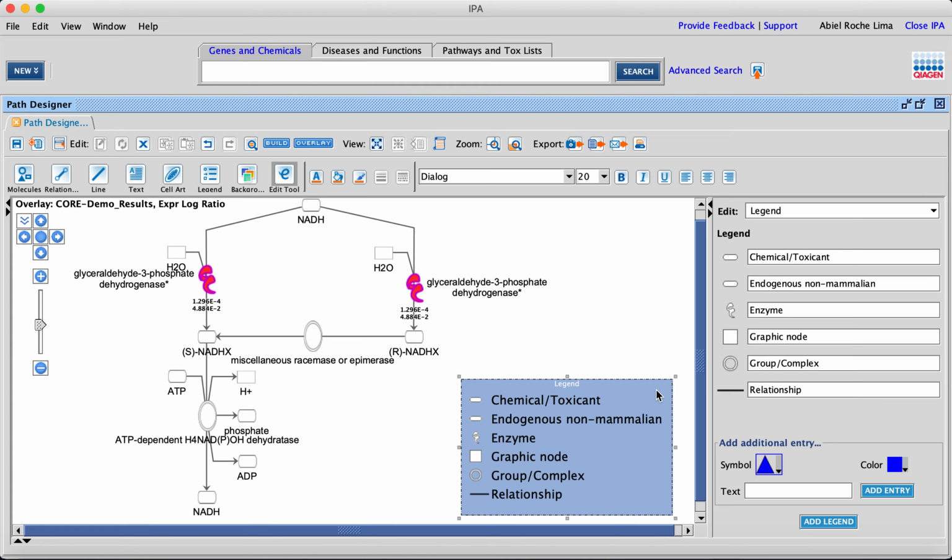Of course, something that adds more to interest in terms of, well, let's assume that this is already something that you're okay to publish. This is something that you want to publish as it is, and you can export this, and you can actually export the table and the images.